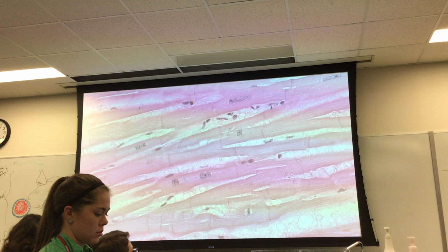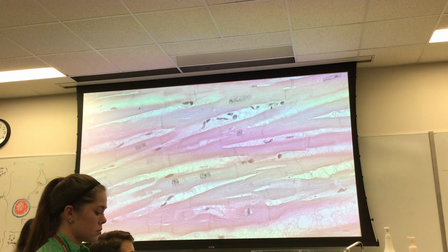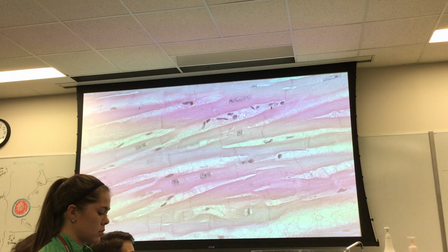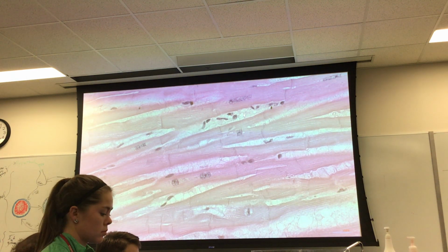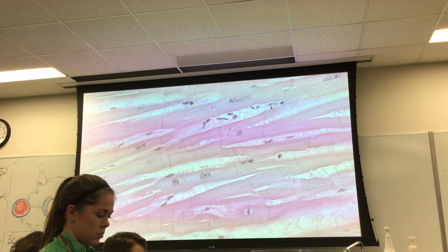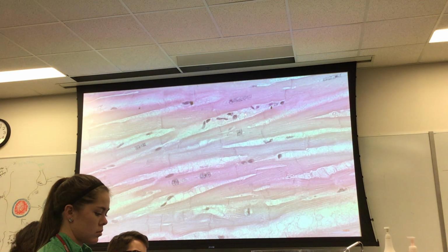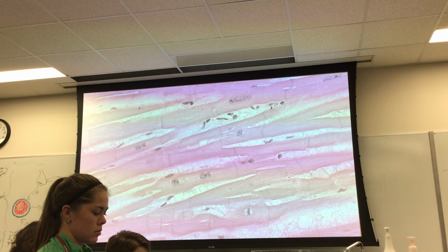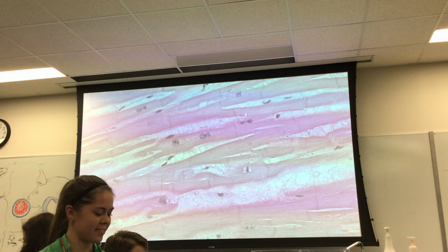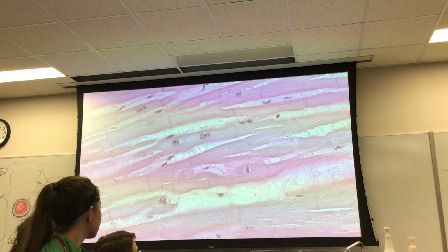Question. The pointer is now, you can't really see it, but right here, what is this tissue? Is that cardiac muscle too? No, it's not cardiac muscle because the cells aren't striated. So, what is it? Well, in doubt, go with connective, right? So in other words, it connects things, and this is connective. In fact, if I drop this image down a little bit, here's a nice field of it right here. So what kind of connective tissue is that?